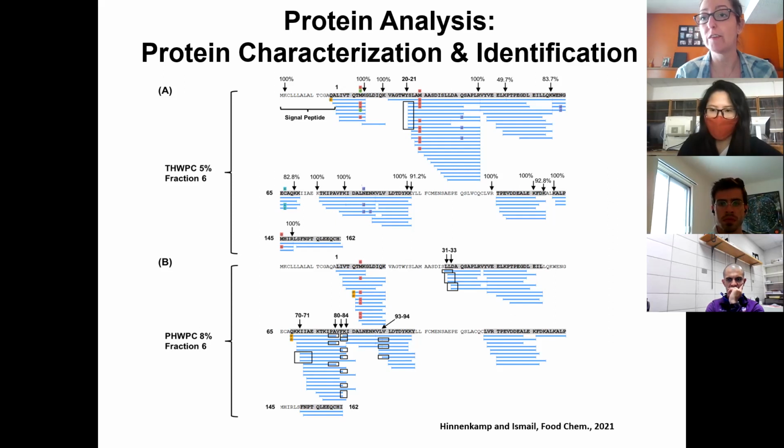Yeah, usually you'll have a cycle for every amino acid. Okay. And each cycle is timed, and there is specific equipment that you would use to do that cycle, the timed cycles to get one amino acid at a time. And if you're dealing with a protein, you don't know how many amino acids are in there, so you just keep going until there are no more. Yes, absolutely.